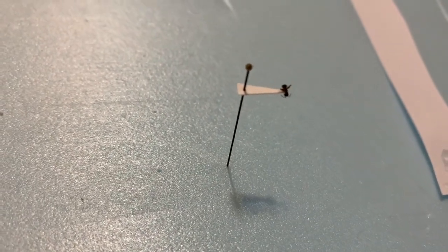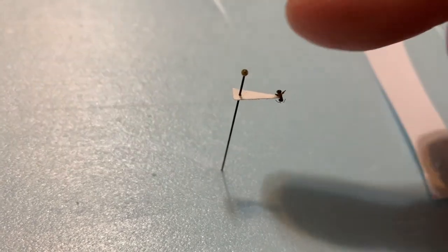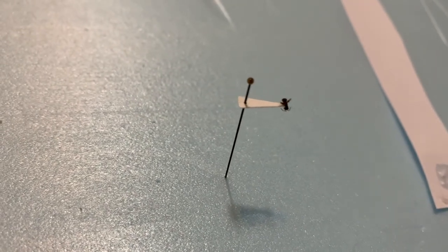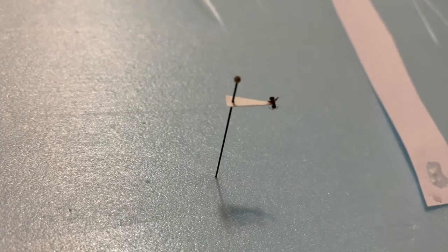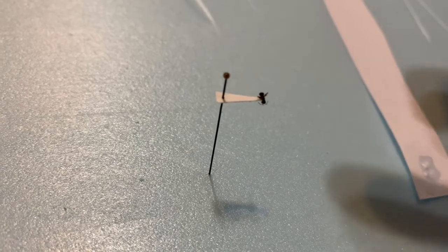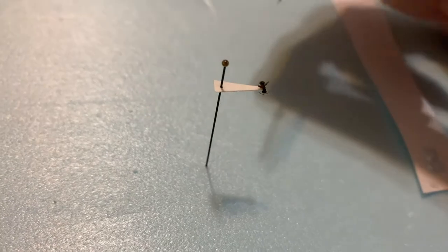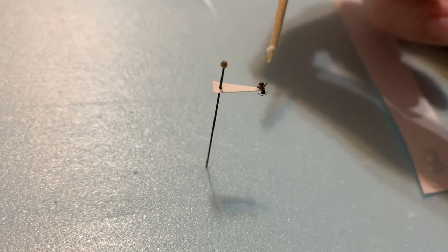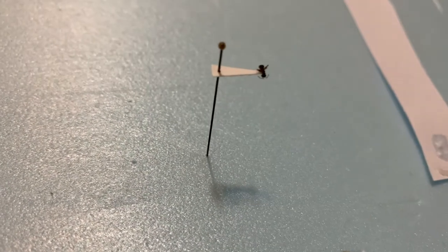So the way this is oriented, we have the insect ventral side down, the head is here, the abdomen is back here. The right side of the insect is closest to the pin. This is how you want to orient all of the insects that you point. And again, I just want to stress that you want your insect very far out on the end of the point. You don't want to try and put it in here or anything like that, because then you can't examine it as easily, so right at the very end.